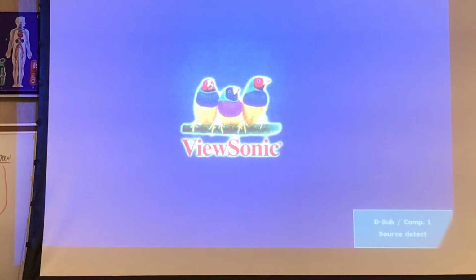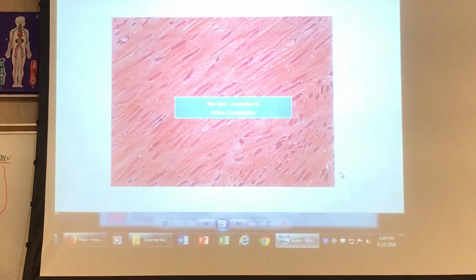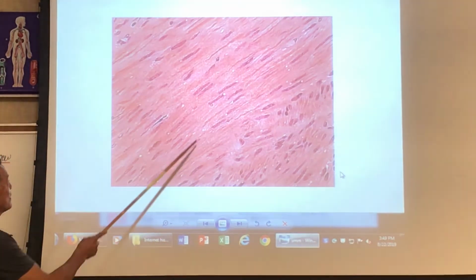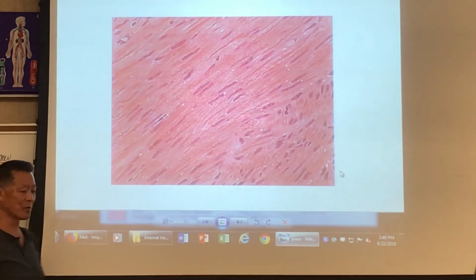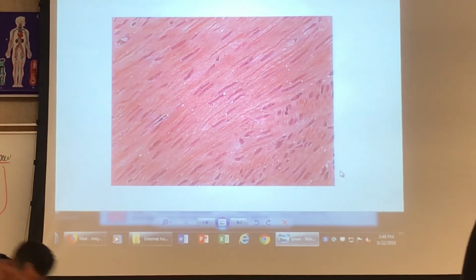Do you see a basement membrane and a free surface? No. Are cells separated by stuff, or are these stacked tubes? Do you see parallel lines? Yes. But how many nuclei do you see, especially when they're touching? This is smooth muscle.